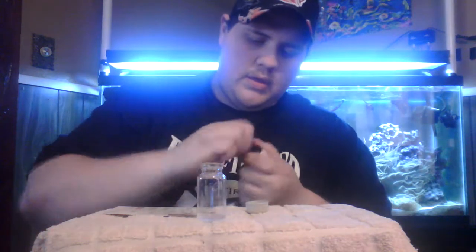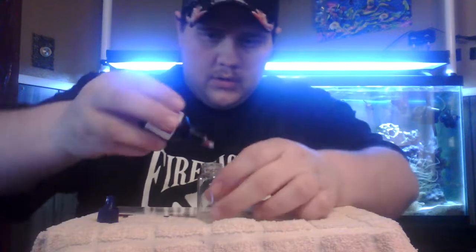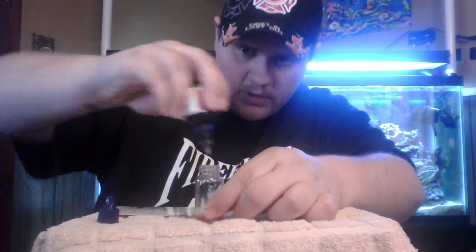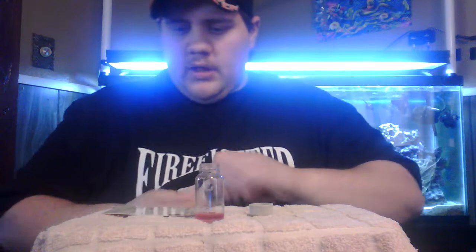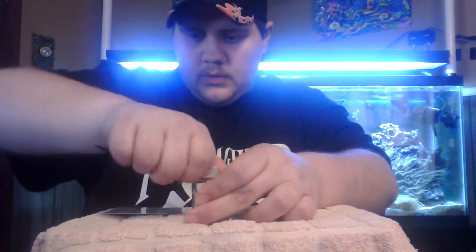Now we're going to take Reagent B and do five drops. One, two, three, four, and five. Now it says to shake for 60 seconds, so we'll put our cap on and shake for 60 seconds.